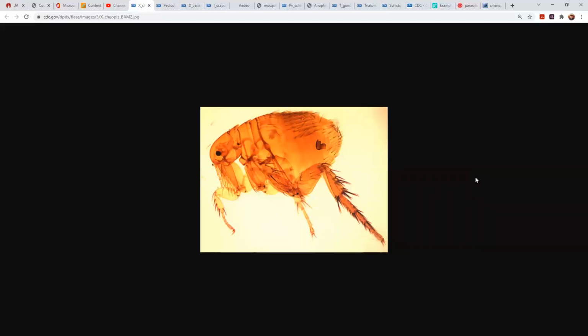In this video, I'll do a walkthrough of the different specimens for Lab 24, which are vectors and pathogens associated with circulatory and lymphatic diseases. So first up here, we have another flea. This will be the third flea that we've looked at.